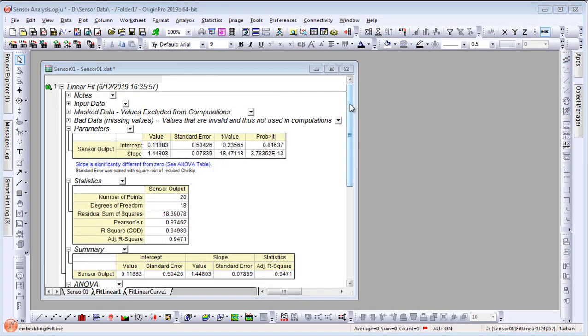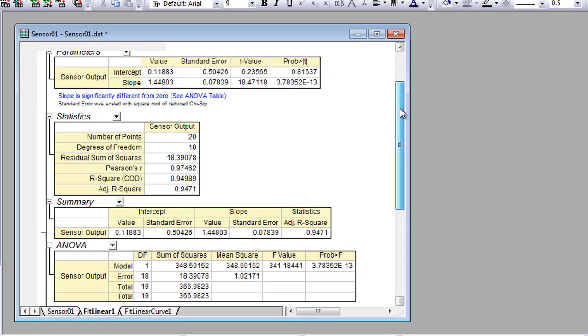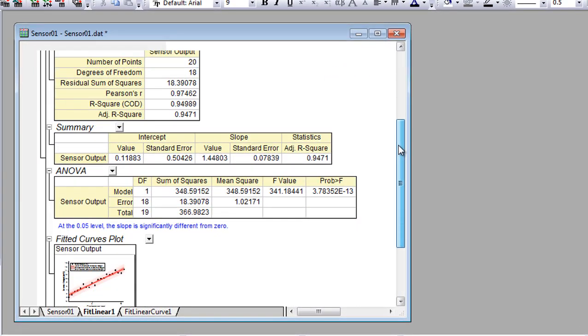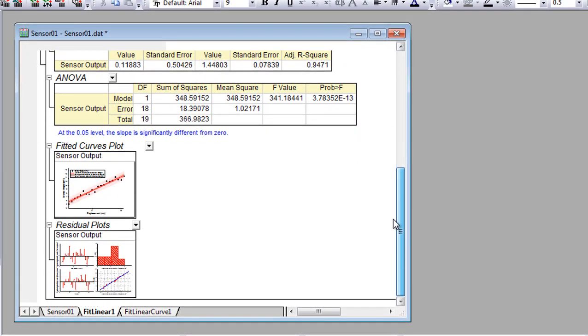When an analysis is performed, a detailed report sheet with parameter values, statistics, and embedded graphs is created.